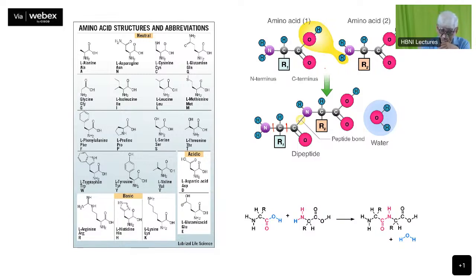Okay. So this torsion angle is fixed. We can say it is 180 degrees, and these other two torsion angles can be very different. That is schematically shown here with this stick diagram. One water molecule is removed, and you form here NH2, CHR, CO double bond O, NH. So this is one amino acid residue, this is the next amino acid residue.